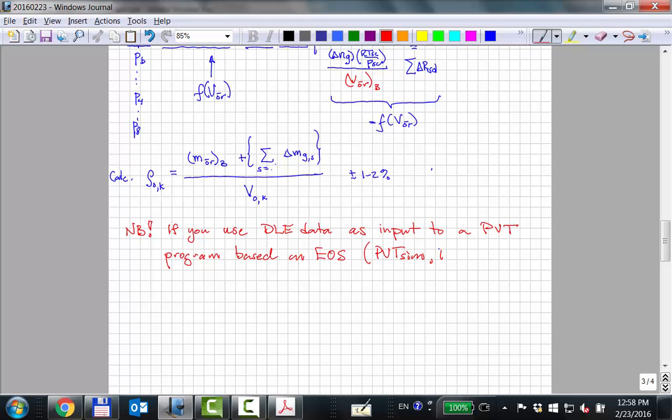There's the one that I use, PhazeComp. I'm sure no one will be using that out there. There's something called PVTP, by Petroleum Experts, PVTi, Schlumberger, and you get the gist, PVTx, Roxar, Emerson. Actually, this I wrote. Anyway, there's a bunch of these.